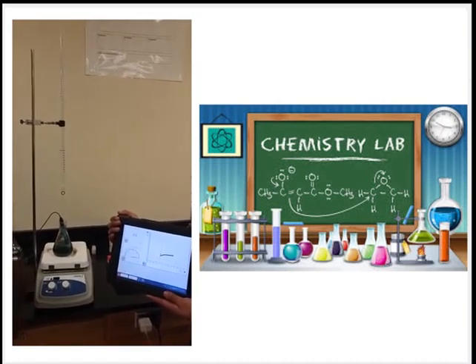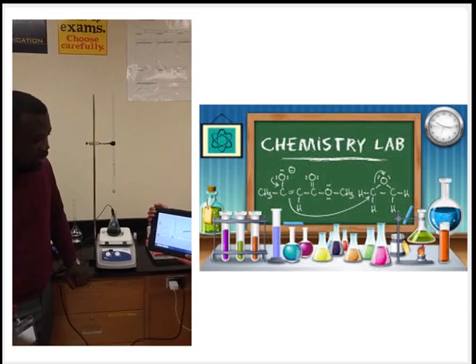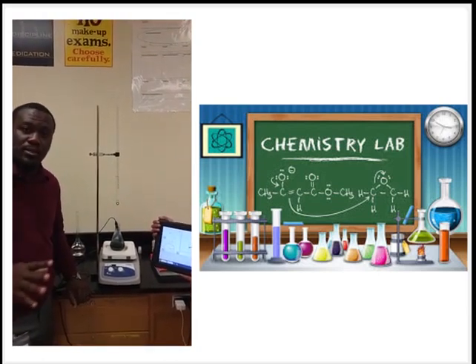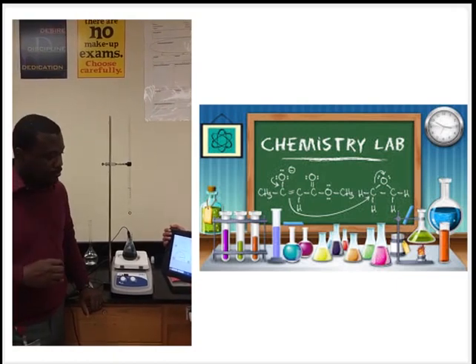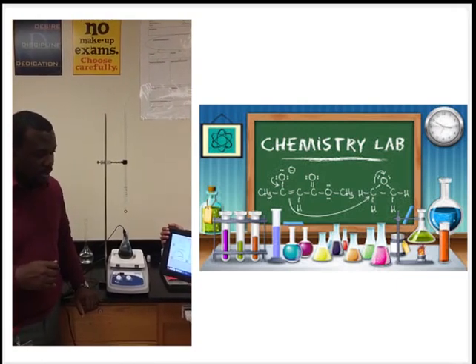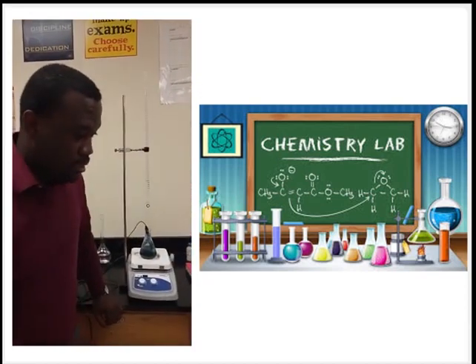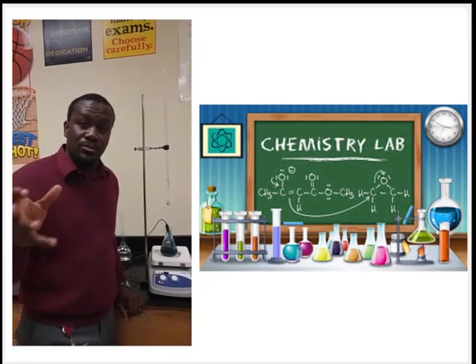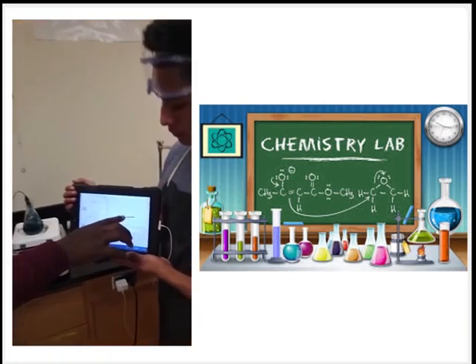Since we started with a weak acid, we can have the equivalence point probably happening above 7. But as you can see, at first, we have to talk about this with my student in class. At first, you see this bump here.